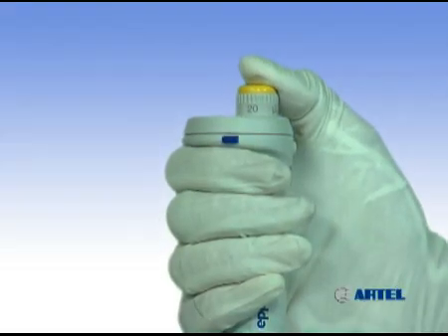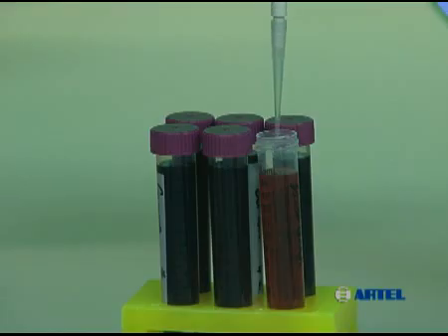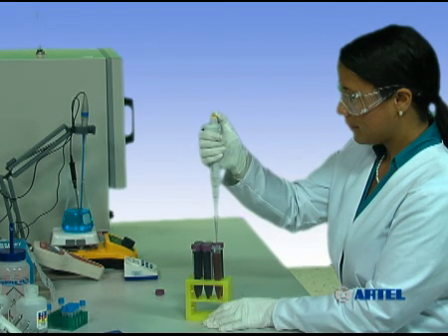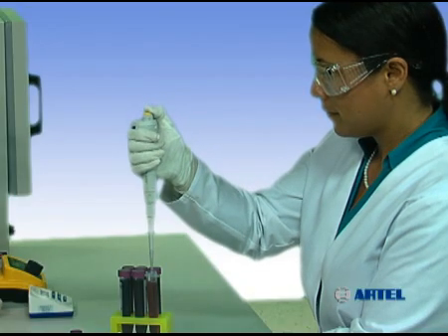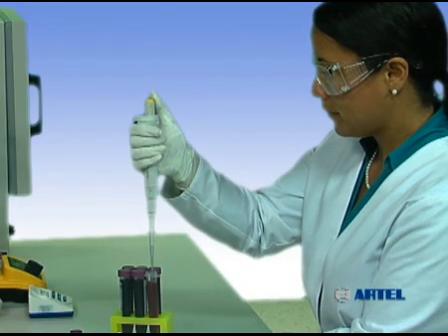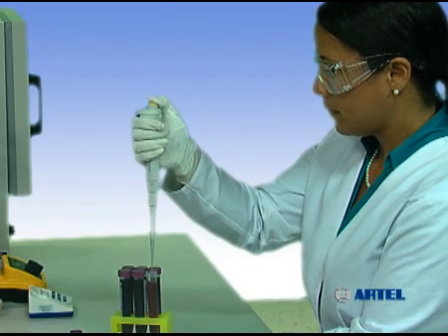Depress the plunger of the pipet to the first stop. Immerse the tip into the sample and release the plunger to aspirate. Remove the pipet from the sample and dispense the entire contents of the tip back into the sample container or to waste. Using the same tip, aspirate and dispense in this manner at least three times to properly pre-wet the tip.